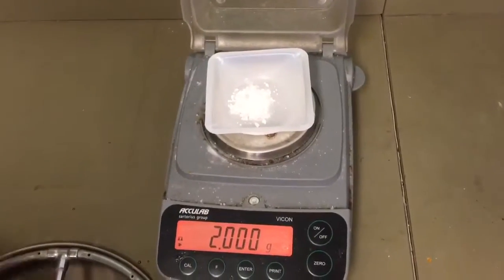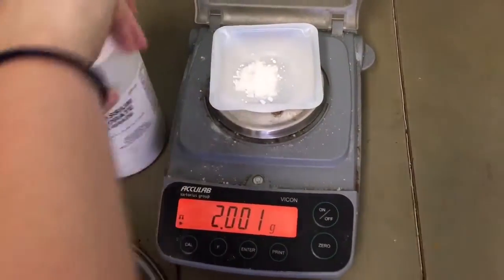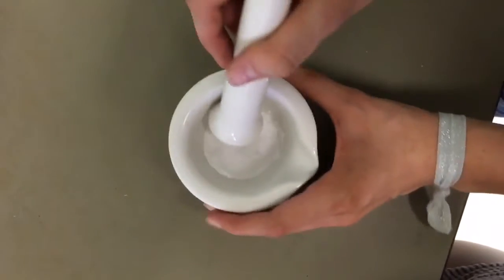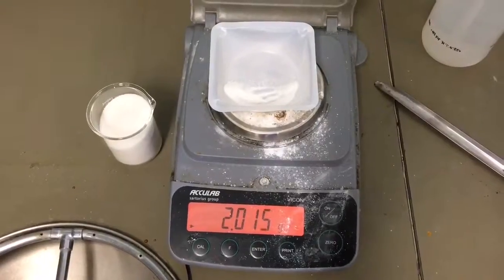Begin by measuring about 2 grams of solid potassium chlorate on an electronic balance to 3 decimal places. Use a mortar and pestle to grind up the solid potassium chlorate into a thin powder.